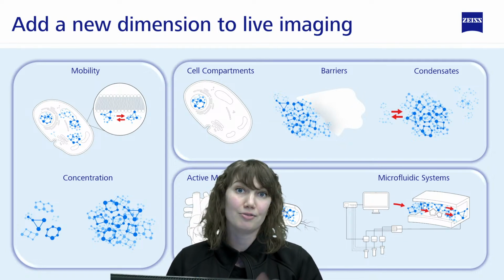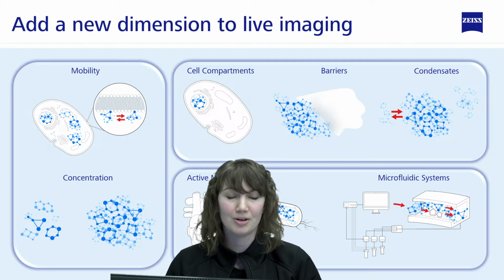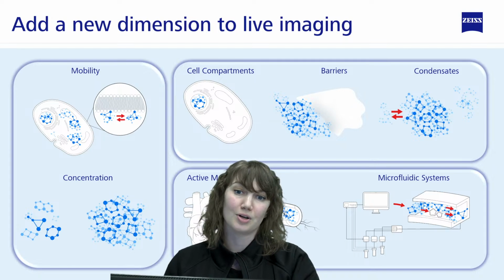If you want to learn more about flow and how to use Dynamics Profiler for that, I'm going to have a ZMCC ZEISS Micro Minute live on July 11th, I think, so keep an eye out for that if you are interested in how the flow module of this works.